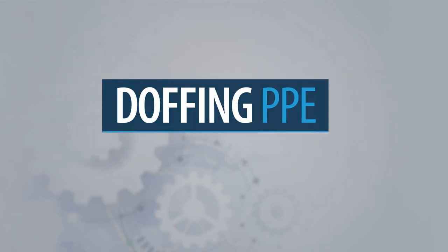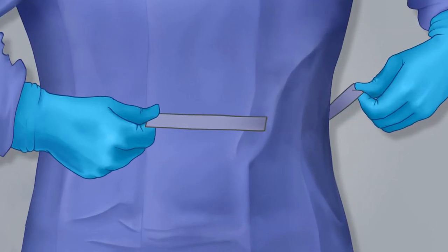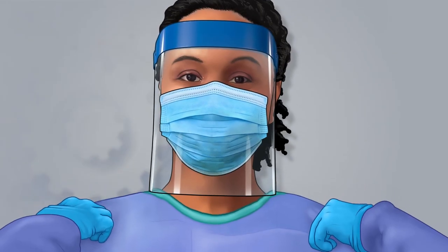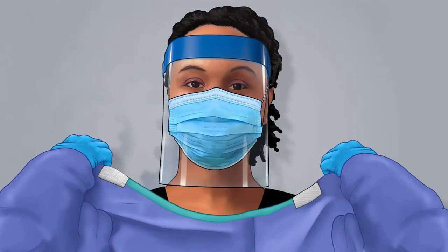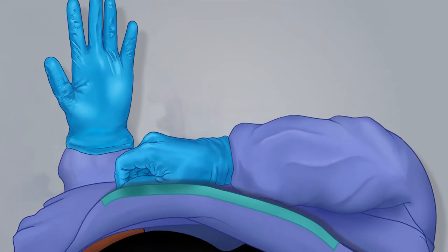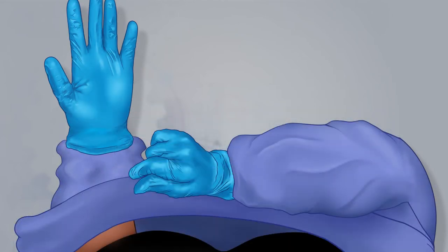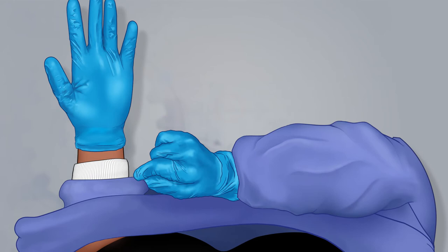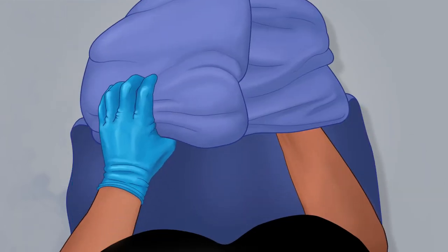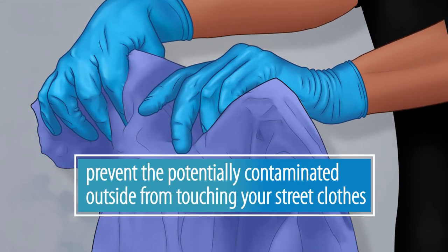The first step of doffing your PPE is removing your gown. To do this, untie the gown at your waist, grasp the gown's shoulders, and pull the gown forward, releasing the neck closure. Pull the gown off of your shoulders and away from your body, rolling the gown inside out as you go. Before completely pulling off the gown's sleeves, carefully pull the gown sleeves from under your gloves and remove your arms, leaving your gloves on. Roll the gown inside out into a bundle, taking care to prevent the potentially contaminated outside of the gown from touching your street clothes.